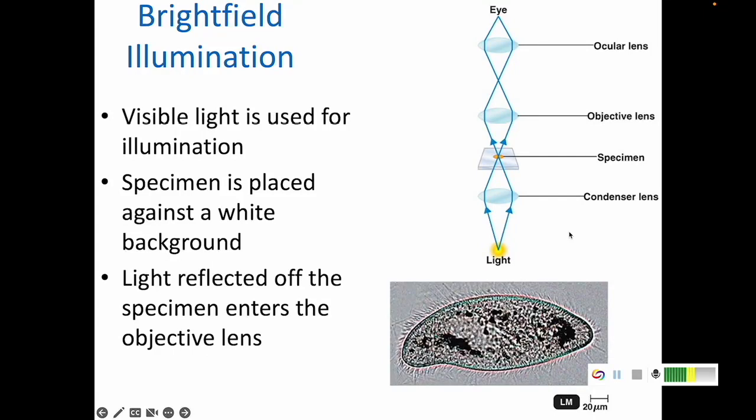Hey, microbiologists, or today I should call you hello, microscopists, because we are doing microscopy today. So, in this video, we are going to talk about different kinds of microscopes. Did you know there were different kinds of microscopes and they all function in different ways?